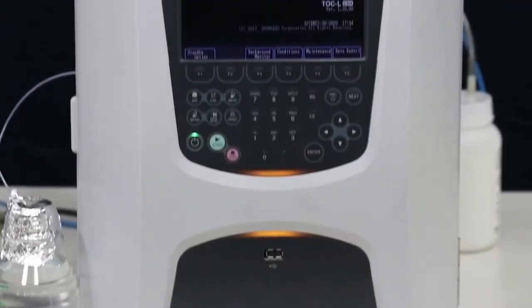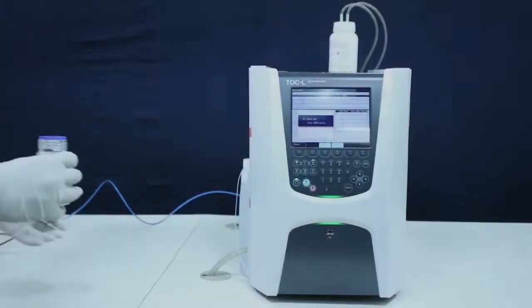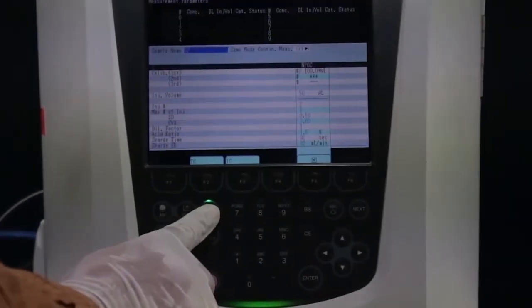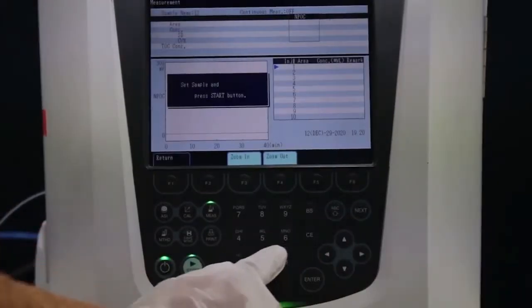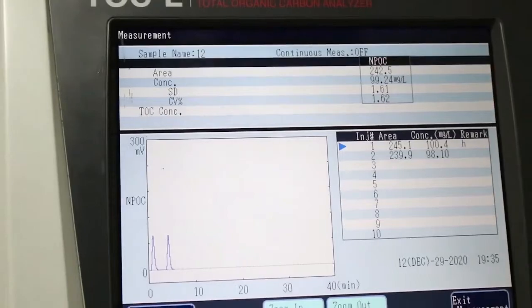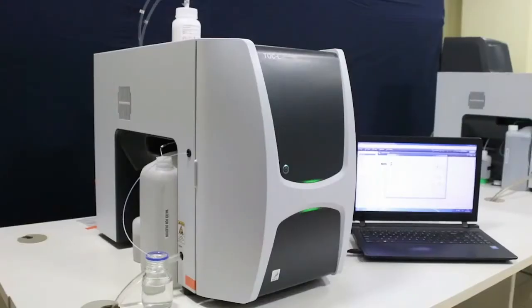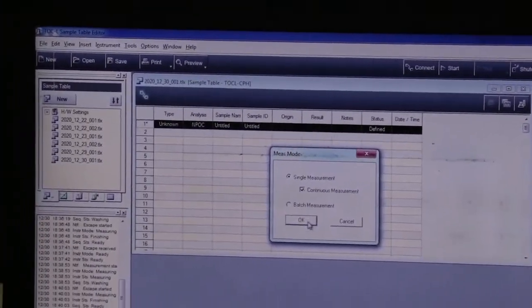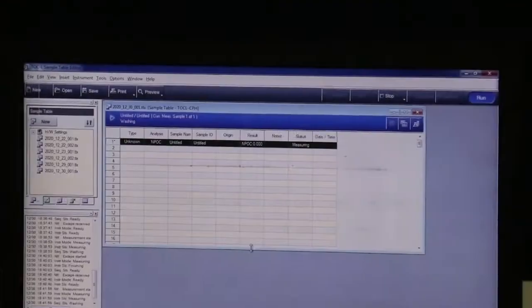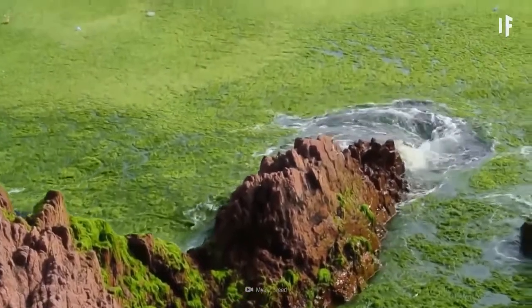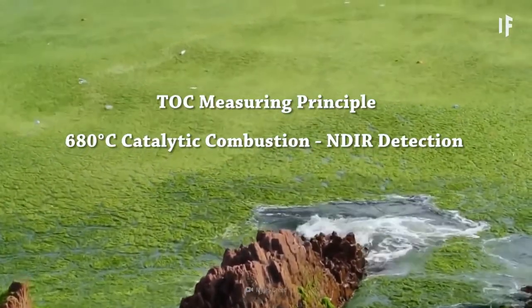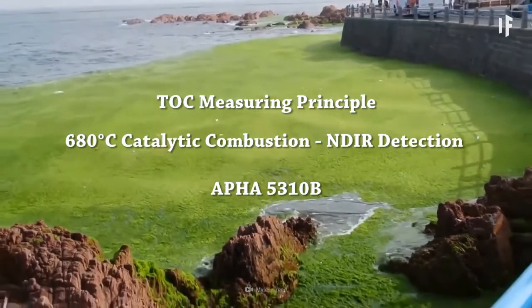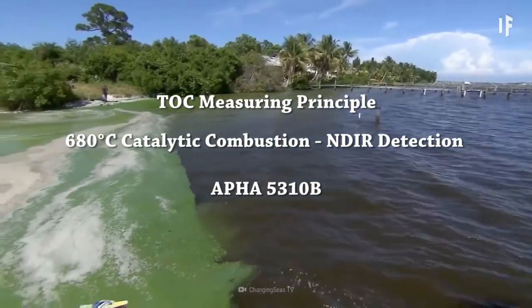By using the Shimadzu TOC analyzer, TOC analysis is made easy and simple — just place the sample bottle in the apparatus and the sample is analyzed automatically. Two models are available: the standalone model with inbuilt method selection via display and keyboard, and the PC-controlled model where software on a PC is used to select methods and programs. The TOC value and peak area are displayed in both models. The measurement principle is 680°C catalytic combustion with NDIR detection, based on reference method APHA 5310B.